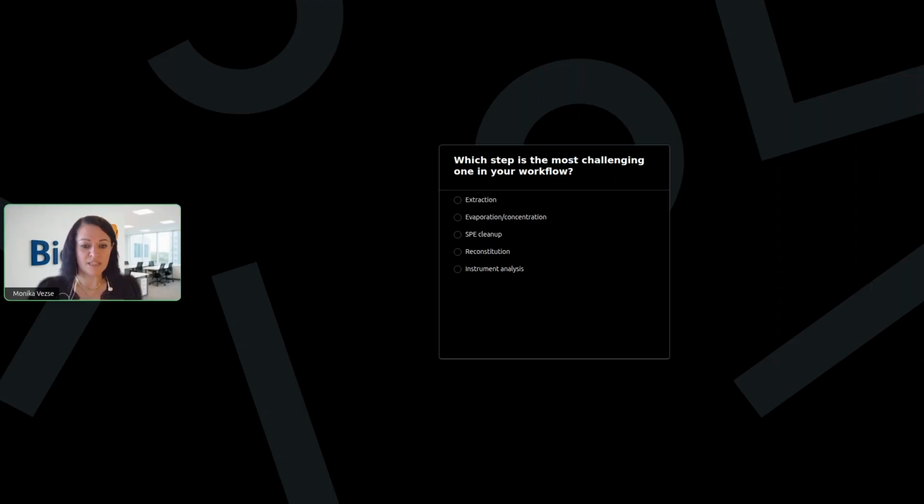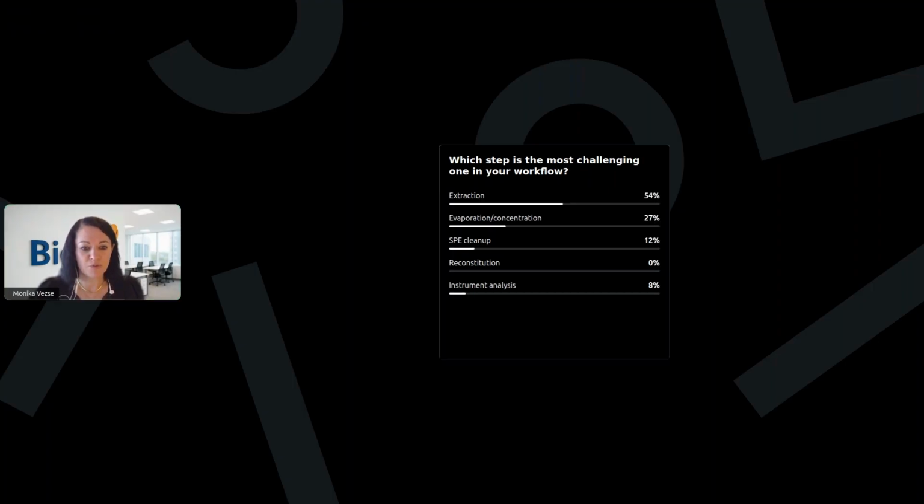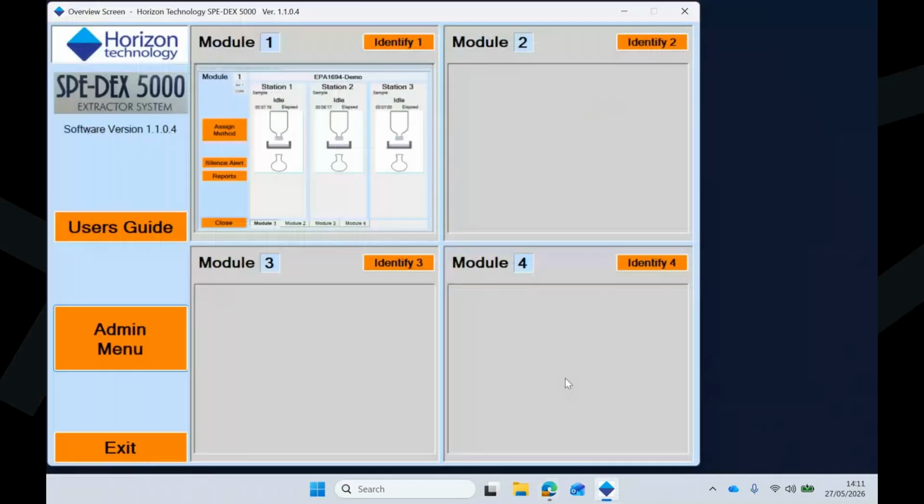All right, thank you very much. So it looks like it is the extraction that seems to be causing the most issues, and that's actually not a surprise. So I guess that's why we are all here today. Thank you very much for the answers. I'm gonna close the poll for now.